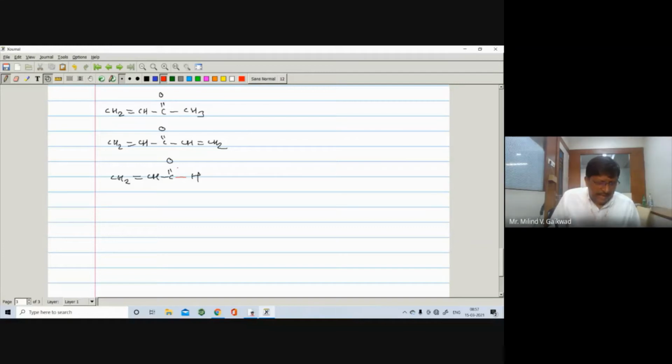So these will appear at 1705, then 1670, and here it will appear at 1685, right?